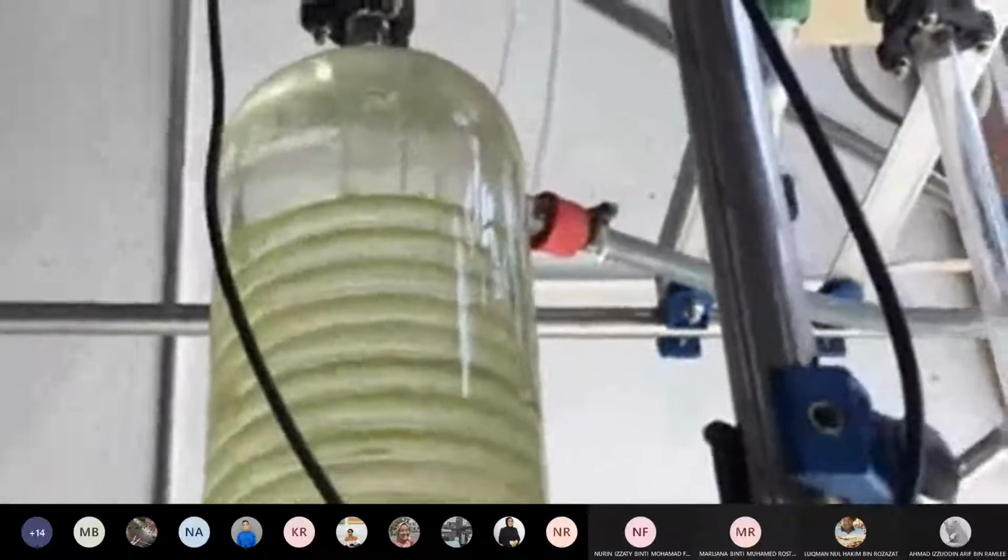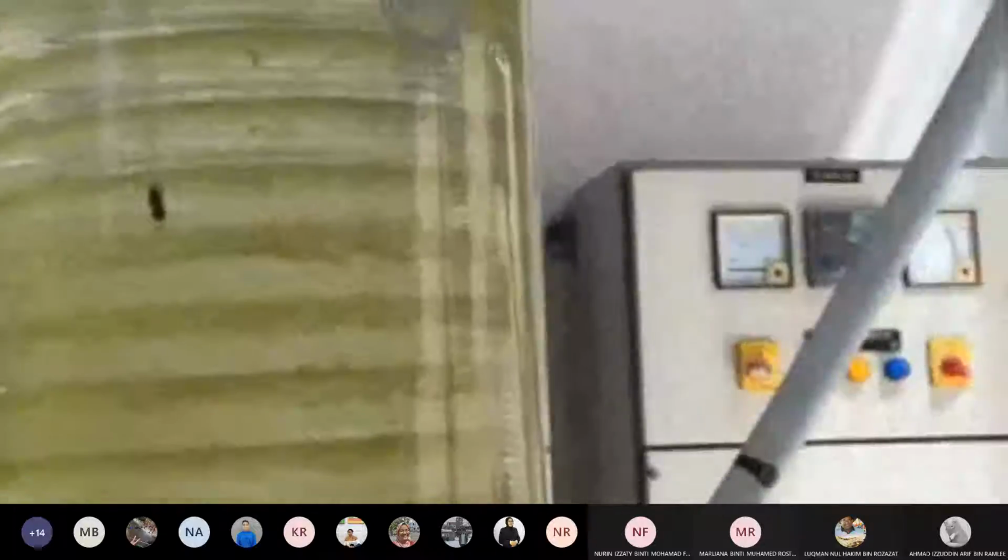So kalau perhatikan dia akan flow masuk. Dia akan flow in. So kalau kamu bayangkan dia mengalir sepanjang coil tube ni sampai ke atas. So dia akan sebenarnya keluar di atas. So you imagine the difference with CSTR, dia masuk satu vessel saja kan. Satu vessel tindak balas berlaku dia akan keluar. Dia akan keluar pada the same direction. Tetapi yang ni dia ada satu inlet dan dia akan keluar at the opposite direction at the top.